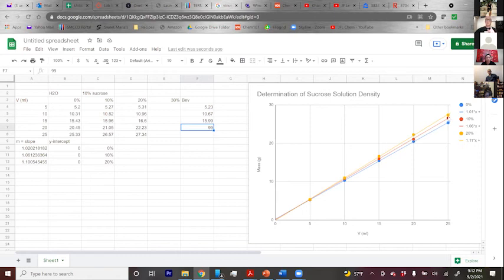And you're also going to want to correct for zero intercept with your unknown beverage also. Okay, thanks. No problem.